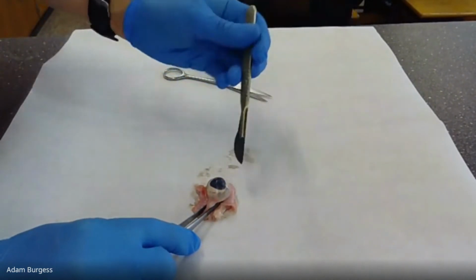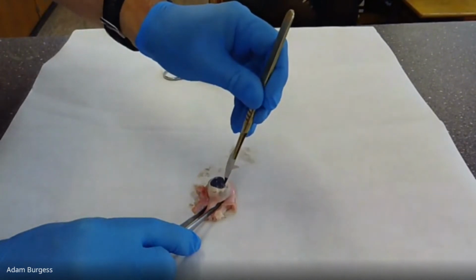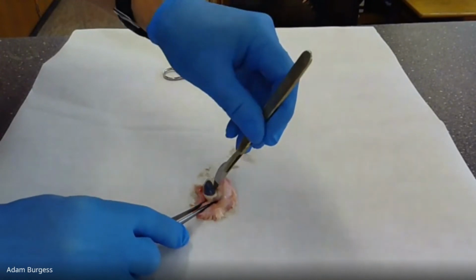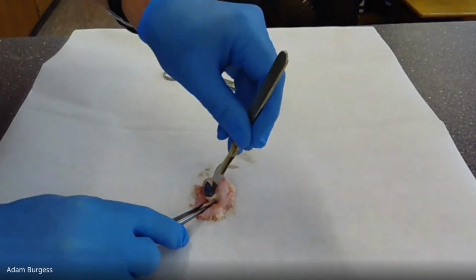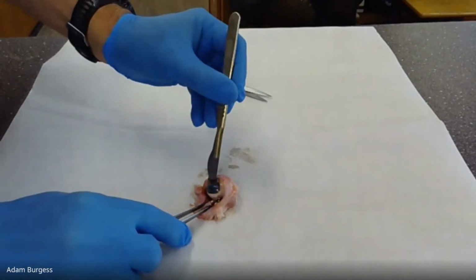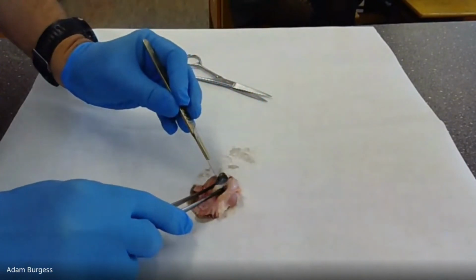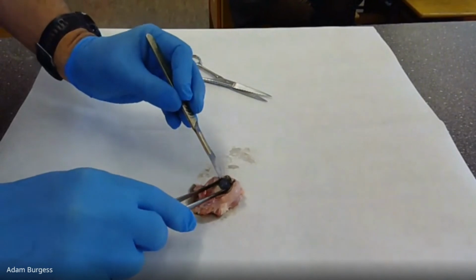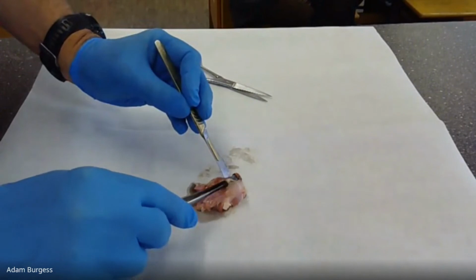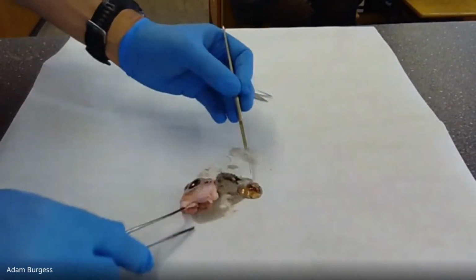But what I'm going to ask you to do first is to just dissect the top bit, the cornea. So you're going to have to really poke in. If you poke too hard as well, liquid will come out. There you go. So what I'm going to do is squeeze out. There you go. That's the lens there.